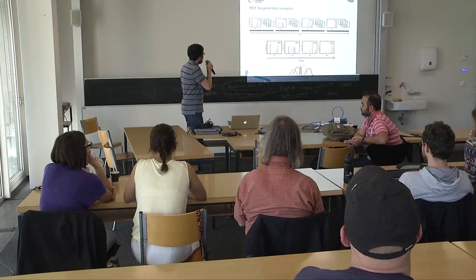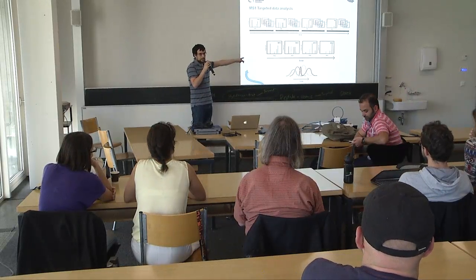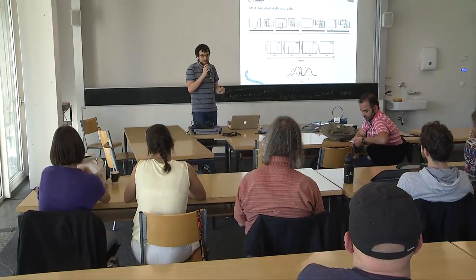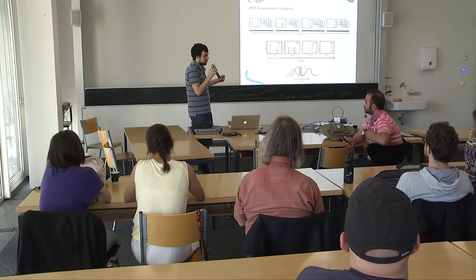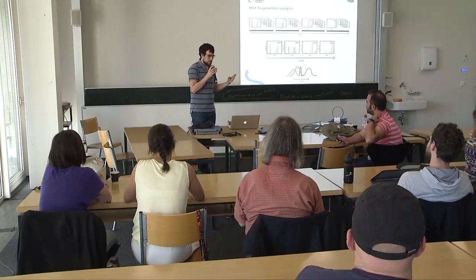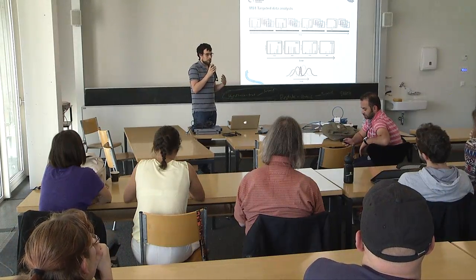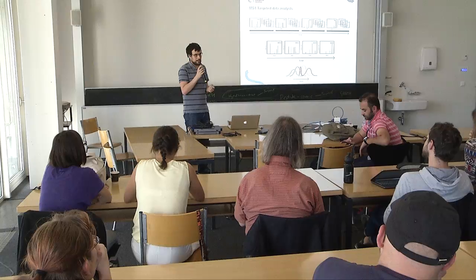Well, what one can do is actually extract, right? So extract chromatographically the peaks at the MS1 level. What I would call this is a data-independent acquisition mode at the MS1 level and data-dependent acquisition mode at the MS2 level. This is how I see this type of experiment. So it's not either one or the other. It depends on which level I see, whether at the first mass analyzer or the second, and how I operate both mass analyzers depending on what is entering the mass spectrometer or the collision cell.